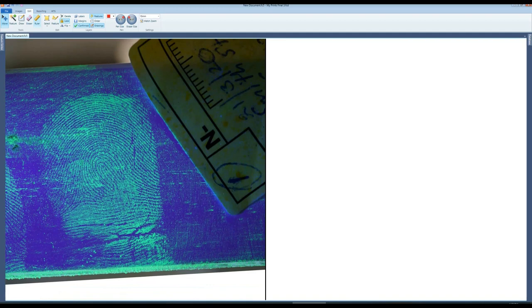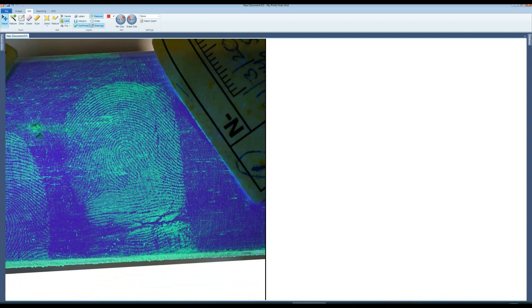Select the ruler to set the image size for the software. Left click hold and then drag the cursor to the size of the scale.